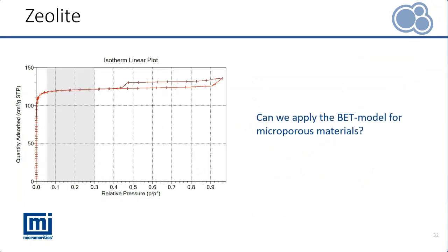Looking at the complete isotherm for this material, we also see from a graphical point of view that the isotherm is already saturated in the considered BET range. We already saw this in the 10-point BET measurement as being really flat. So even if we could think of a stage where a monolayer inside the micropore is established, that would have been the case at lower relative pressures.